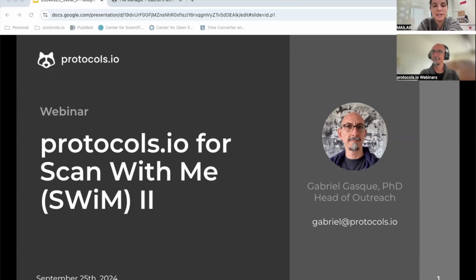And if you remember last time, he went over showing us what protocols.io is and what it's used for and all the features that it has. And this week, the focus will be on how to actually use it and to get you familiarized with the platform so that all the group leads can then upload their imaging protocols to protocols.io once SWiM is actually this week. So yeah, thank you very much again for your time. And whenever you're ready, then you can start.